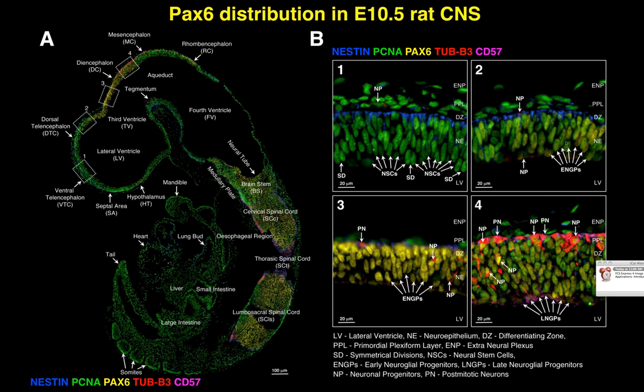Just because the cells have a little bit of PAX6 expression does not mean that they're going to differentiate right away. It is really a threshold, like in panel 3, where we can see a huge upregulation of PAX6, which then over-dominates and switches the cell to truly asymmetrical division.